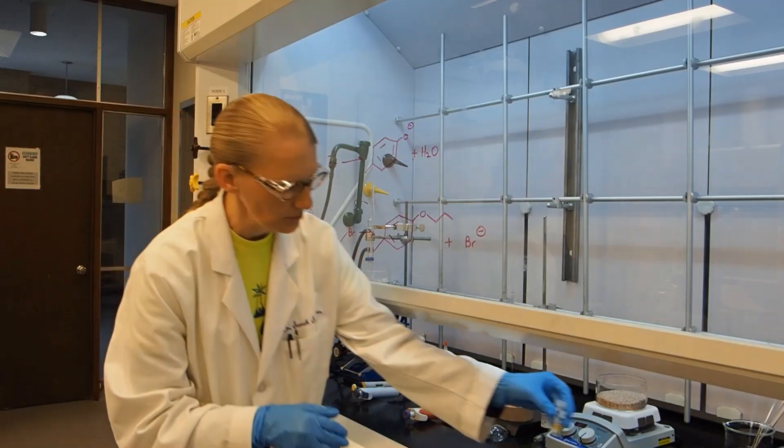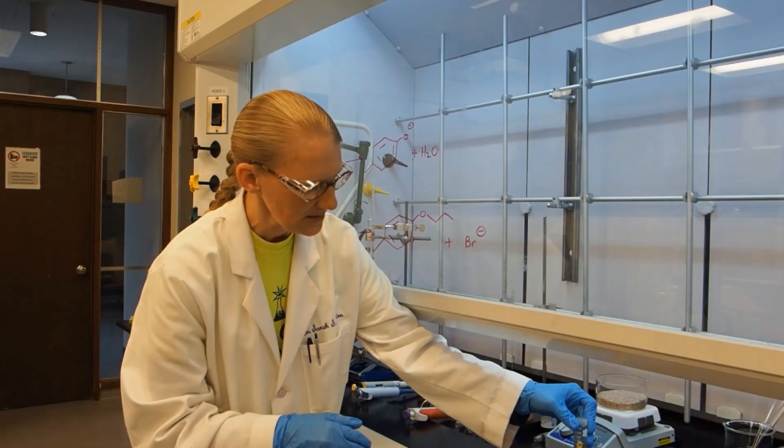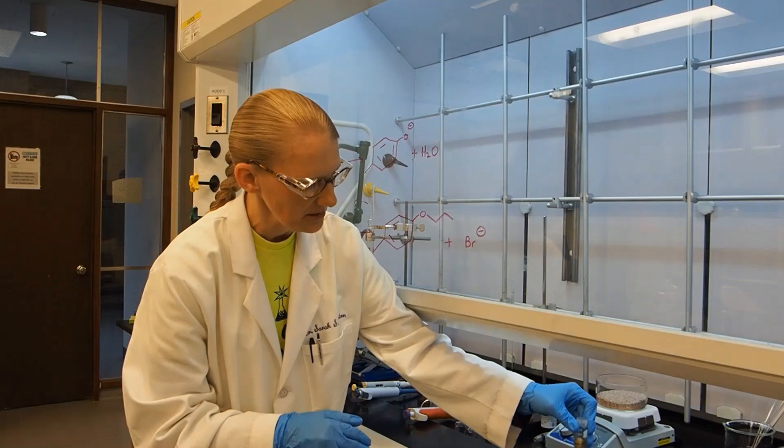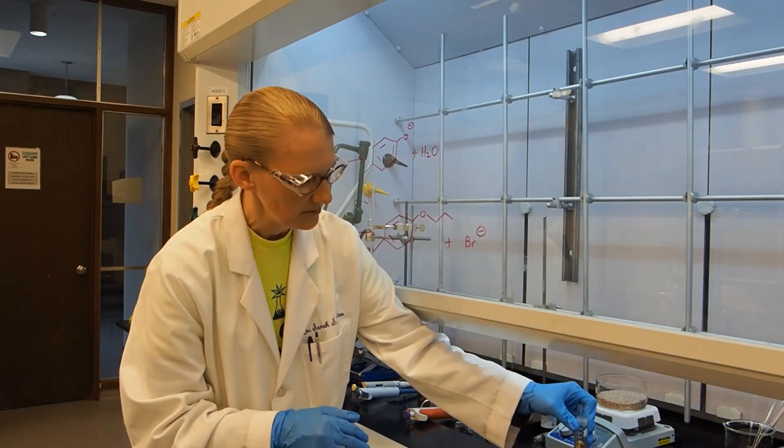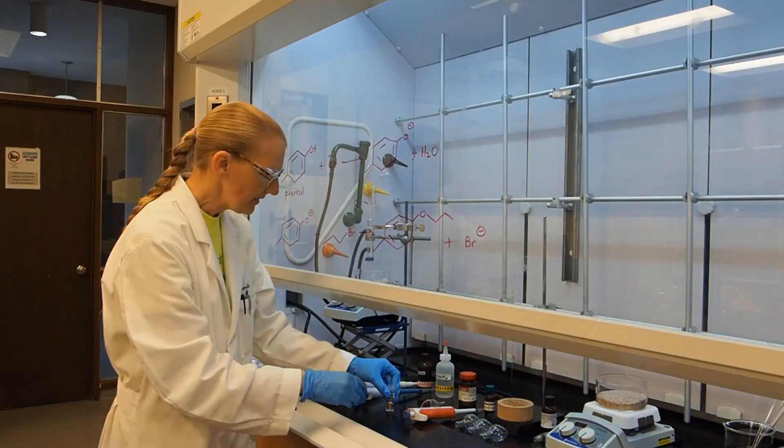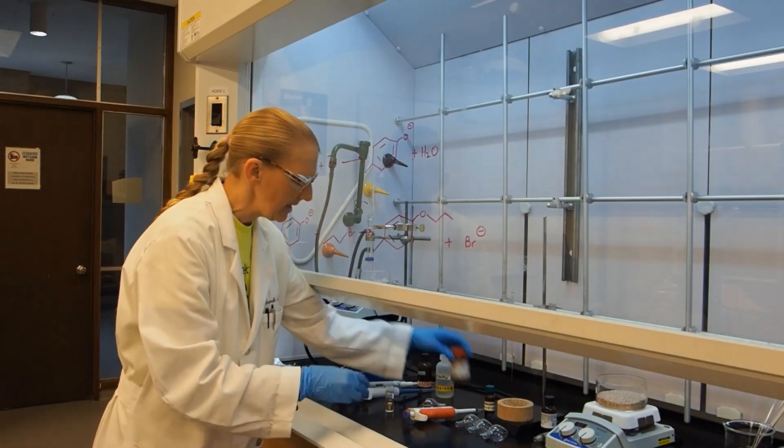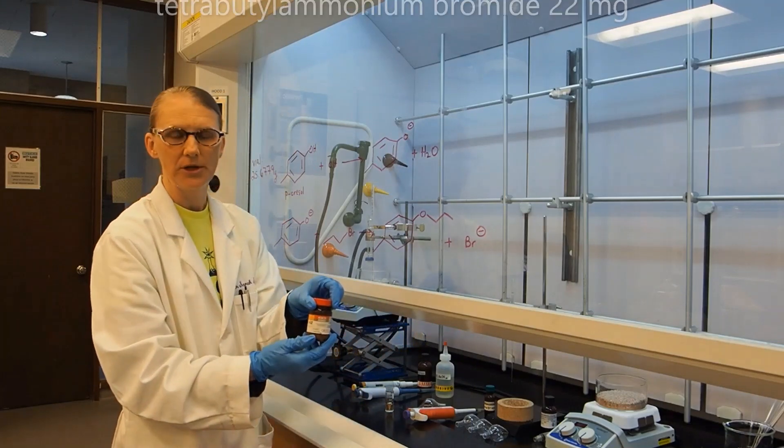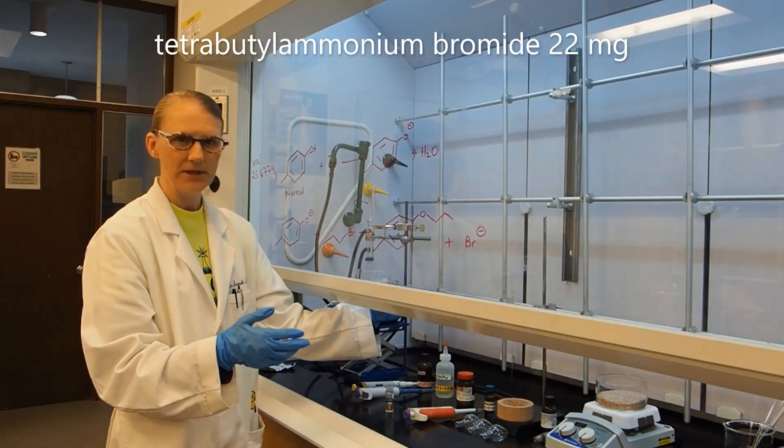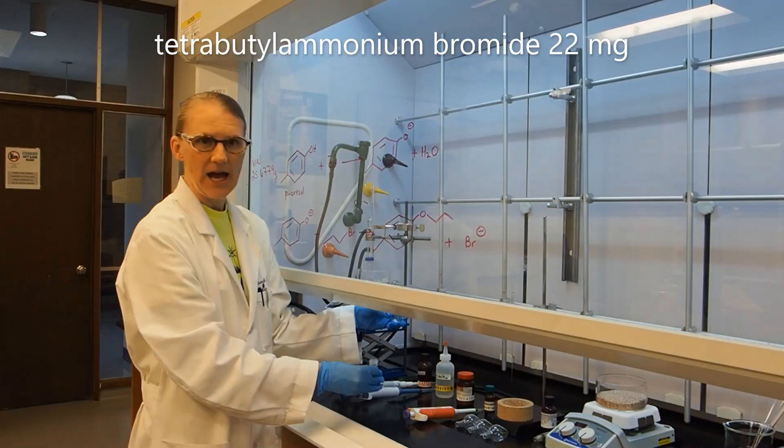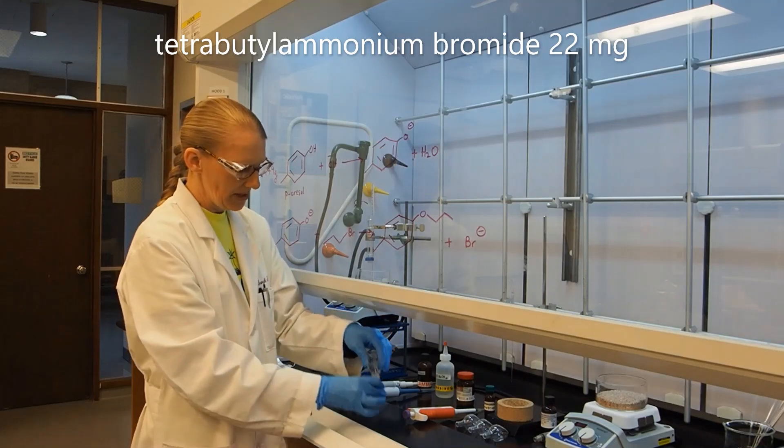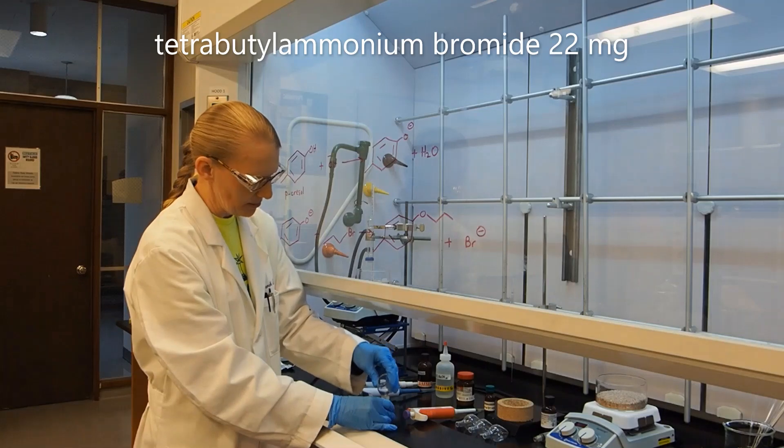After this step I'm going to vortex mix so that it mixes up a little bit. The next thing I'm going to do is add the tetrabutylammonium bromide, which is the phase transfer catalyst. I've already measured that out with the balance. You're supposed to add 18 milligrams. This is about 22, so it's a little bit extra, but some of that's probably going to stick to my glass weigh boat anyway.